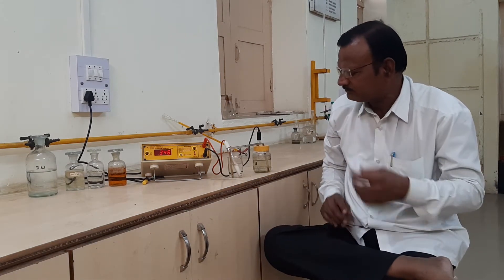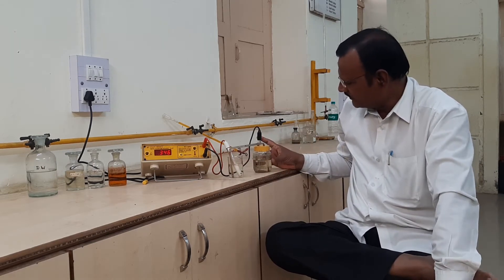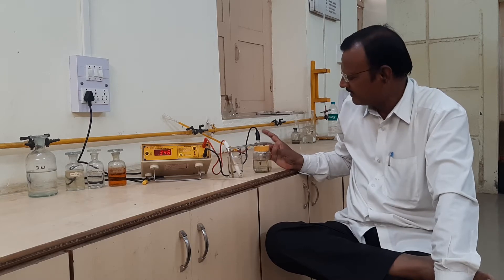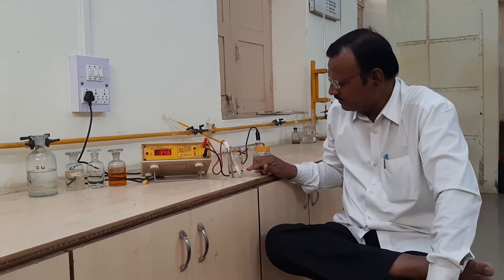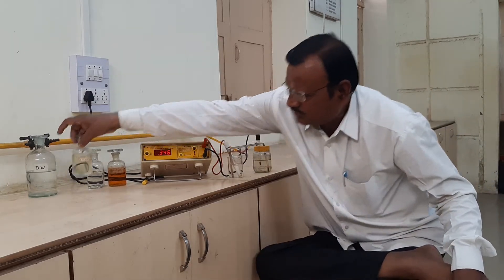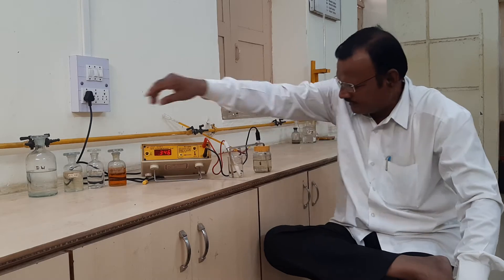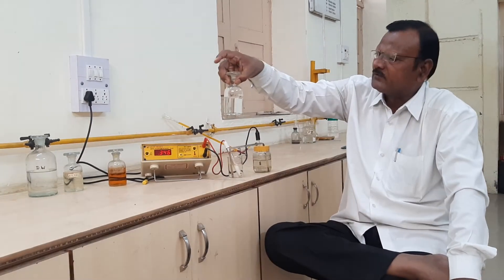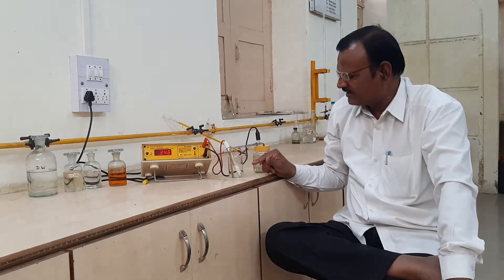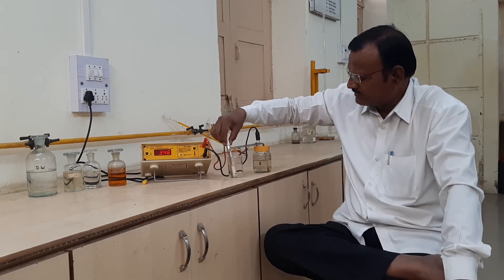There are two half cells: the first half cell and the second half cell. In the first half cell, we have to fill the calomel electrode with a saturated solution of potassium chloride. In the second half cell, we have to withdraw 10 ml of ferrous ammonium sulfate solution from the stock solution, then add two normal sulfuric acid, and dilute the solution up to 50 ml by adding distilled water. Then we stir the solution.